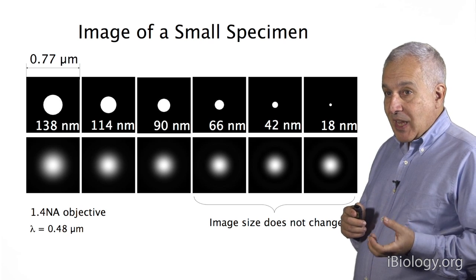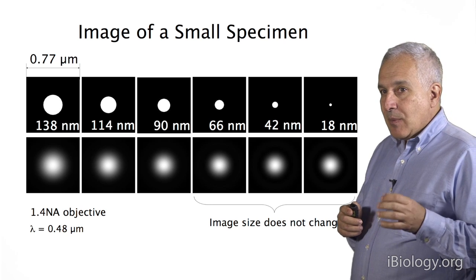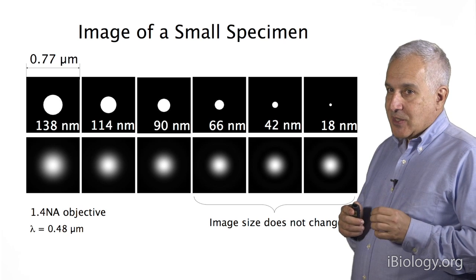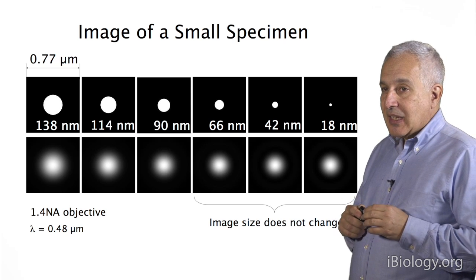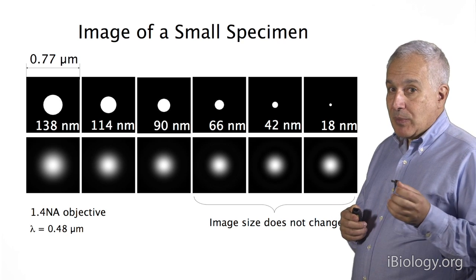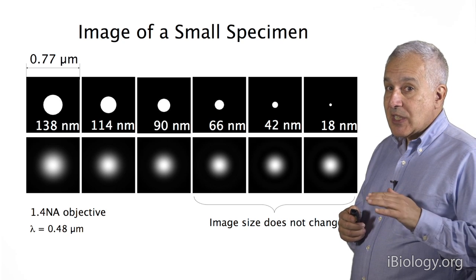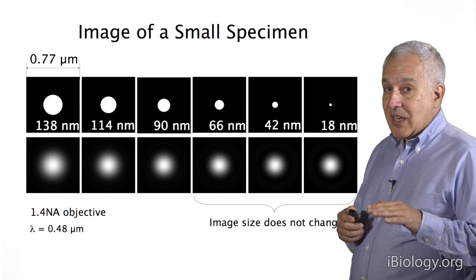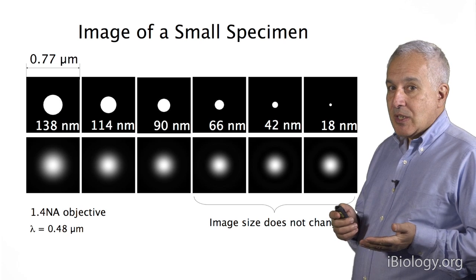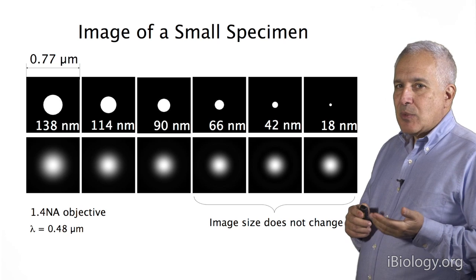What I would like to talk about is that if you have a resolution limit and you want to get the most out of that objective, you have to not only pay attention to the quality of the objective, but the image itself has to have a grain that's capable of seeing the finest details. And that is often an obvious missed opportunity in a lot of imaging, where people have very expensive objectives, but they don't take images at sufficient resolution in the imaging plane to see all the details that actually exist there. So I want to talk a little bit about sampling an image and why one has to think about this a little more deeply than perhaps you might immediately think.